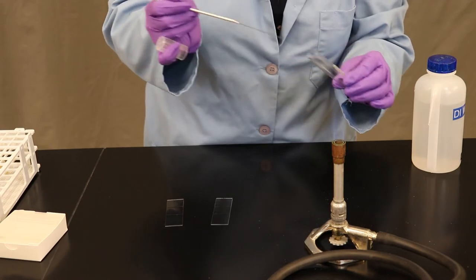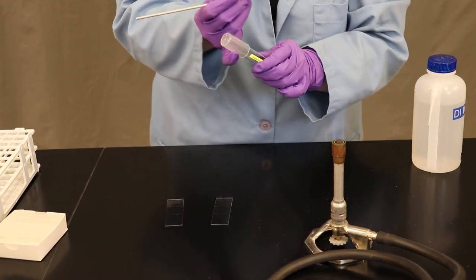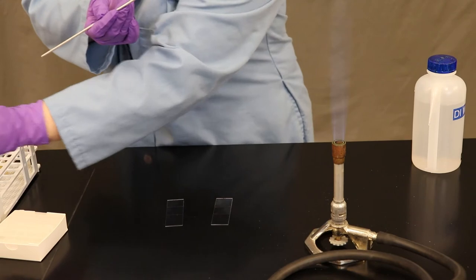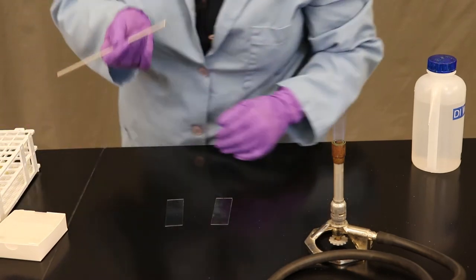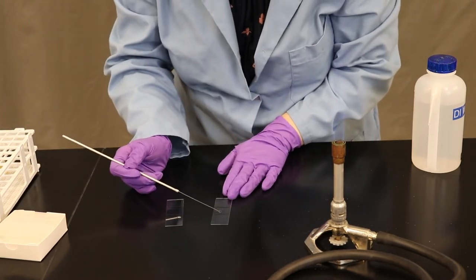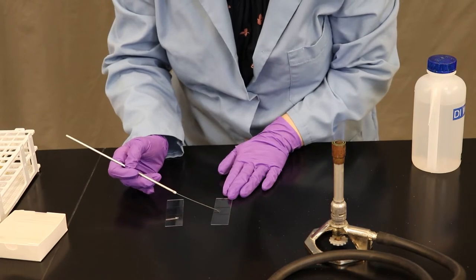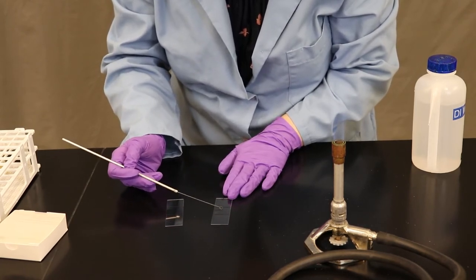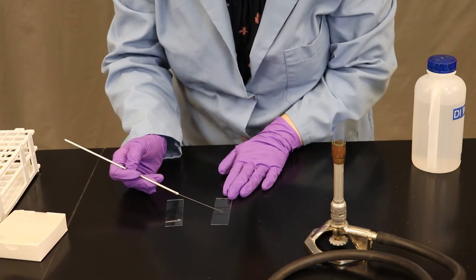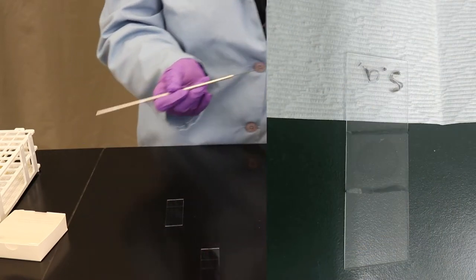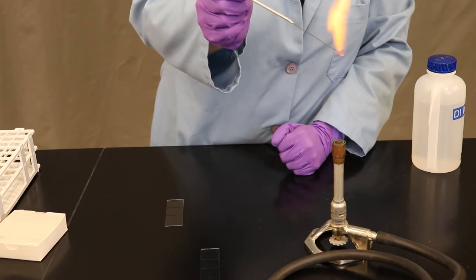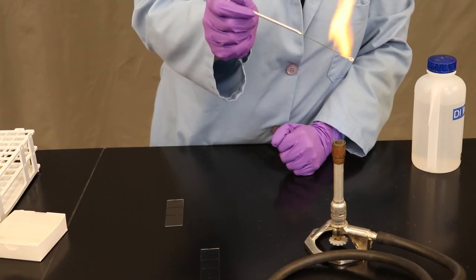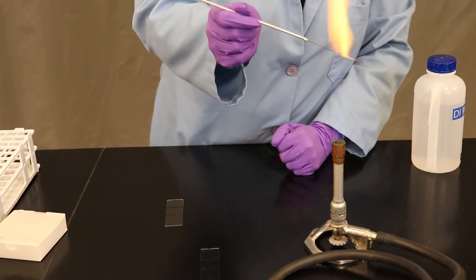Next, dip your sterile loop in the broth to pick up the culture. Pass it through the flame one last time and set it down. We're going to tap off any of the liquid from your culture onto the glass slide and mix it within the boundary that you marked. Be sure to sterilize your loop one more time before setting it down or before dipping into your next culture.